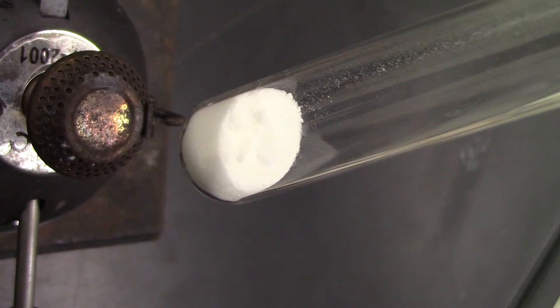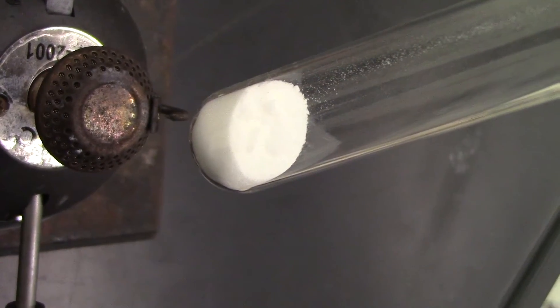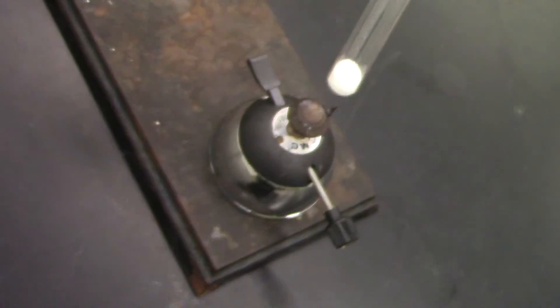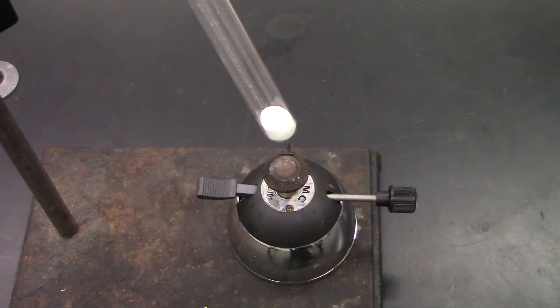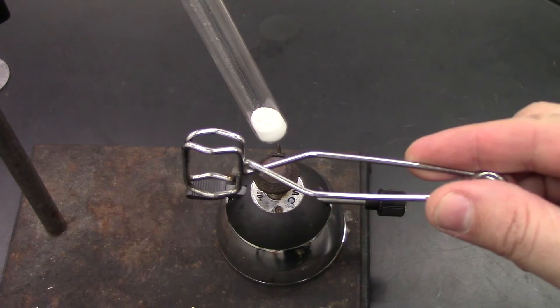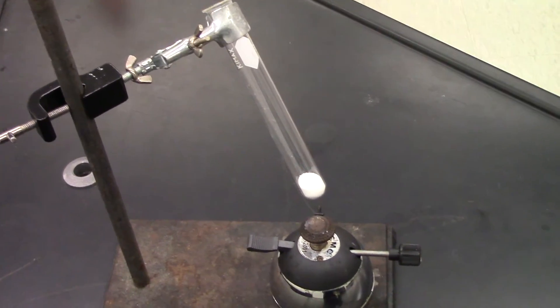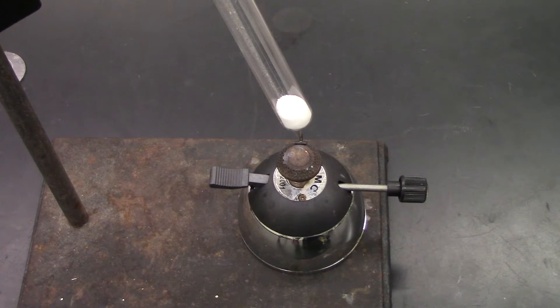Here I have some baking soda in a test tube. This is sodium hydrogen carbonate, the official chemical name for baking soda, and we're going to have it go through a decomposition reaction by heating it. My lab setup is going to be a little different than the one in the classroom. I have set up a test tube clamp so that I don't have to hold both the test tube and the camera. Let's light the flame and see what happens to the baking soda once it starts heating up.